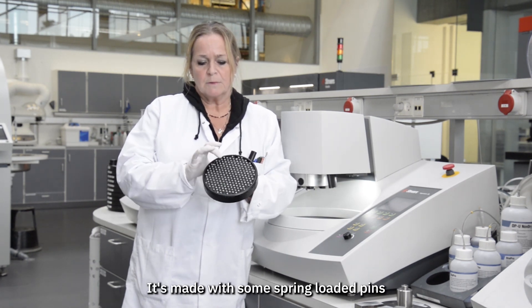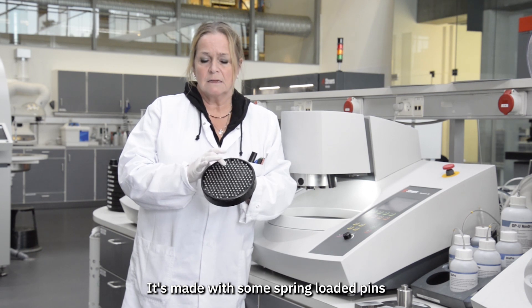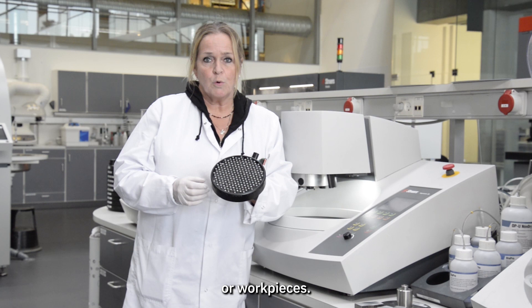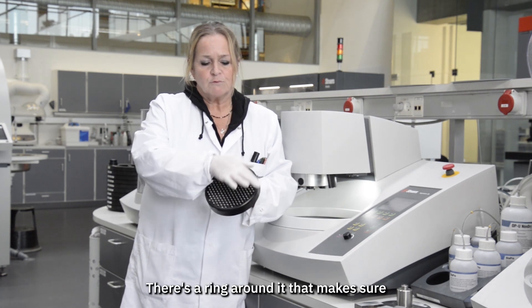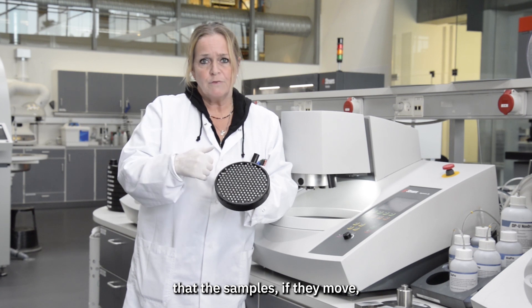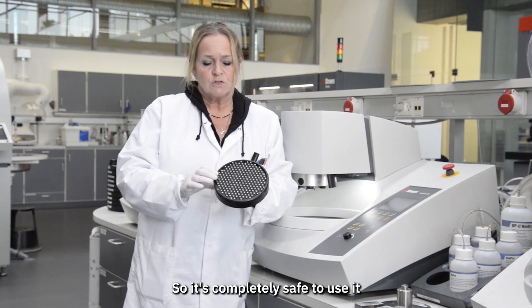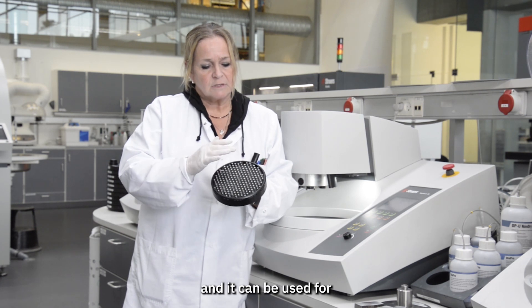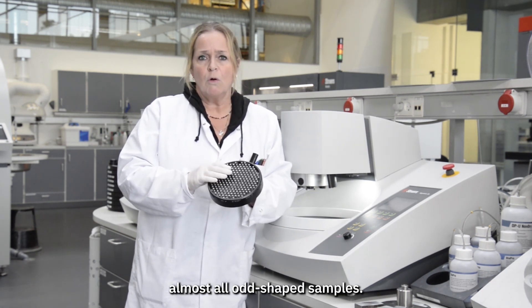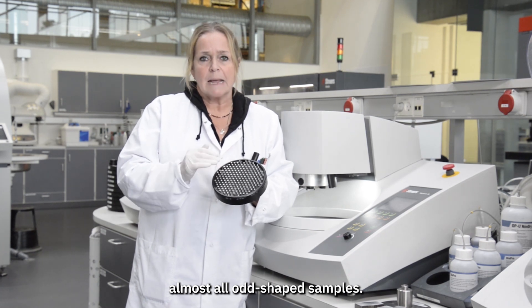It's made with spring-loaded pins that are used to apply force on the workpiece or workpieces. There's a ring that makes sure that the samples, if they move, will not slide out. So it's completely safe to use, and it can be used for almost all odd-shaped samples.